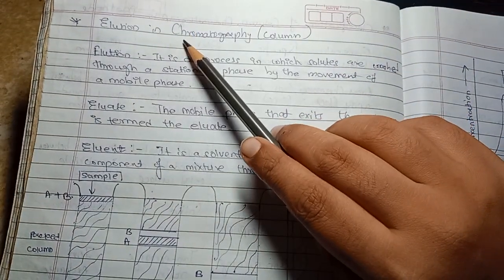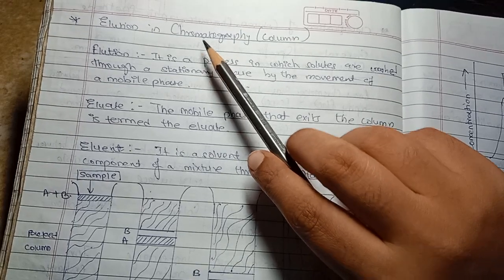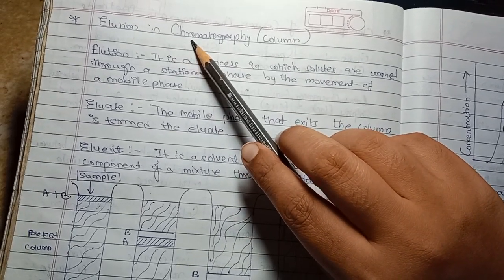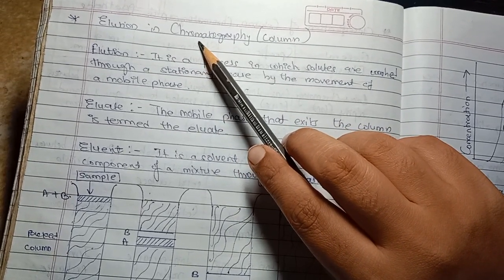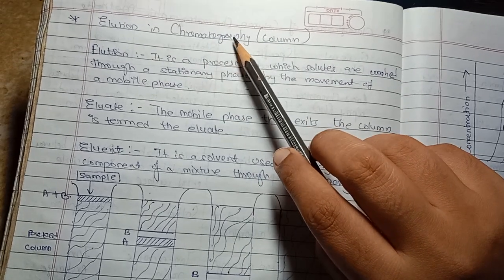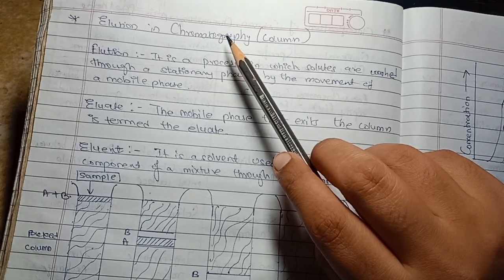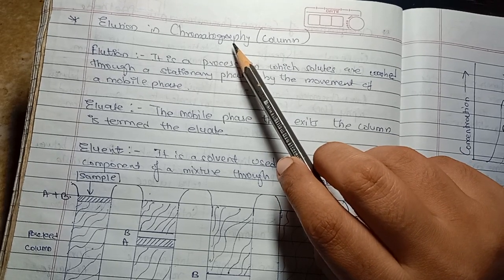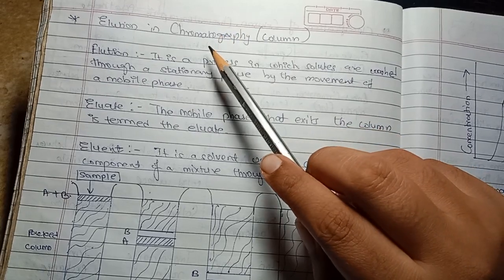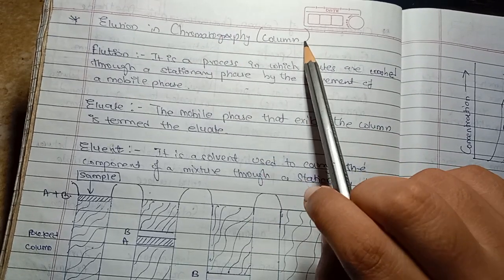Hello friends, today we are going to learn about elution in a chromatography column. We already understood what a column is and the classification of chromatography, and we also understood what column chromatography is, and that there are different types of column chromatography. Now we are going to learn about a topic which is elution in a chromatographic column.